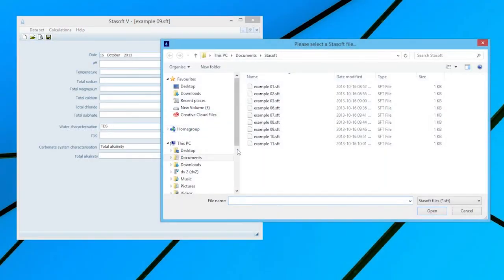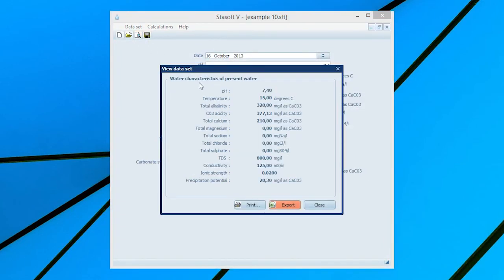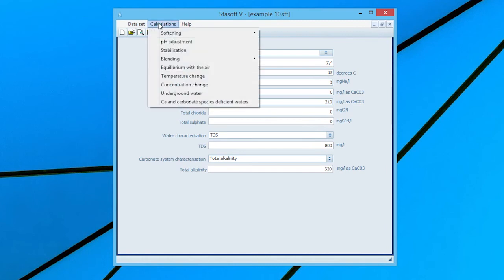Determining the final state of an underground water after the three-phase equilibrium is attained. Select Dataset 10 for Example 10 in the manual. After entering the data into the Dataset input window, selection of the View option will bring a window displaying the characteristics of the present water onto the screen. Close the window and select the Underground Water option from the Calculations menu, bringing up the Underground Water Input window.